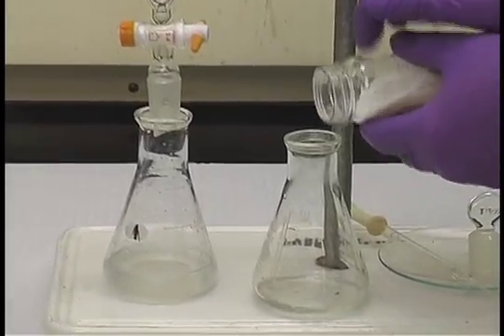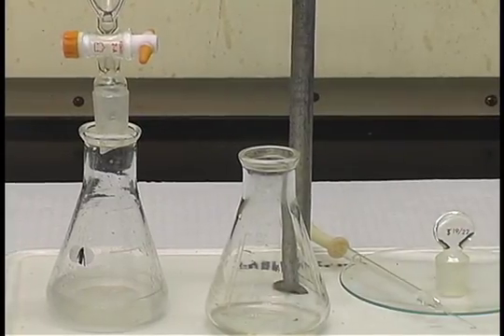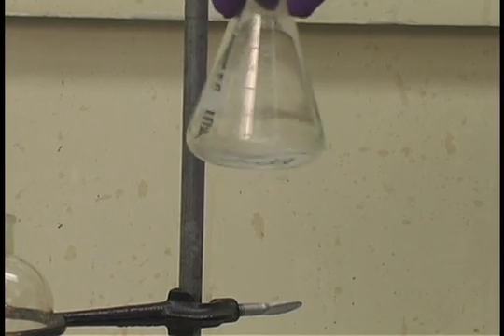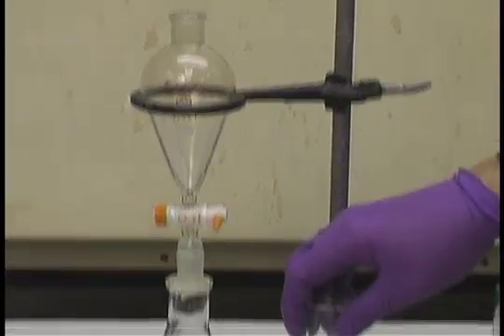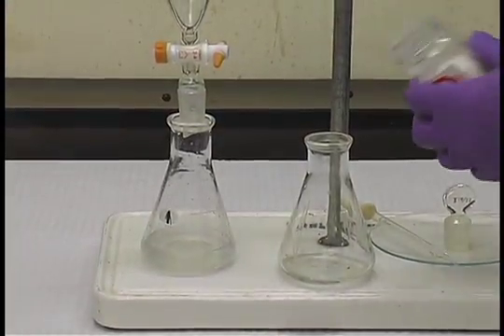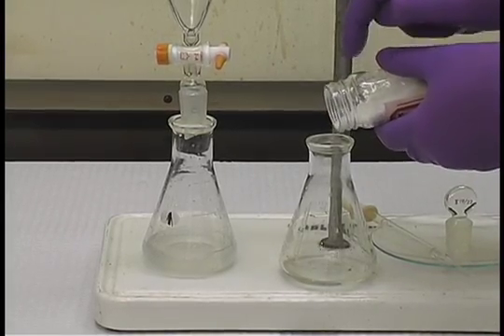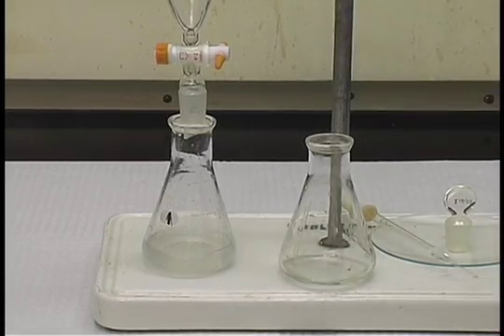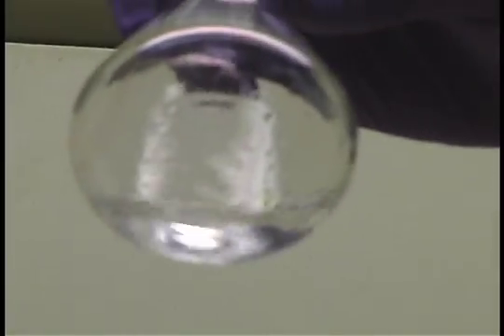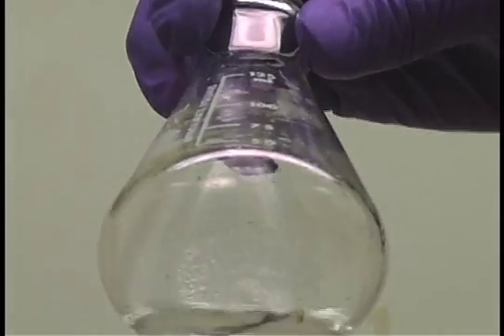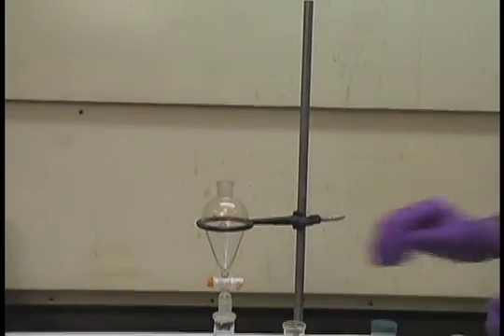Simply put a few granules of the anhydrous sodium sulfate into the flask and then swirl. Do this for about a minute and repeat the process until you see free granules floating. At this point, all the granules are still stuck to the bottom of the flask, so just add a few more. And then swirl. There are a few granules floating free in the bottom, and so that means that the liquid is sufficiently dry. Allow that liquid to stand for one minute.